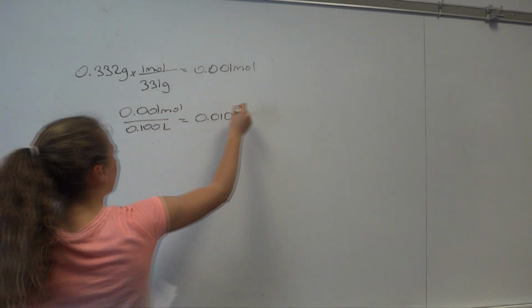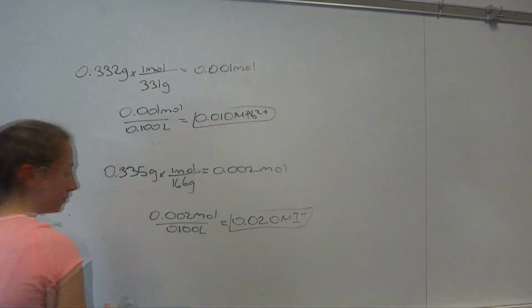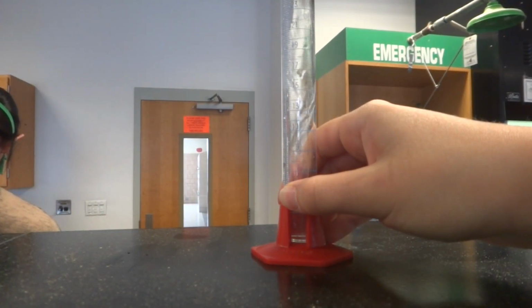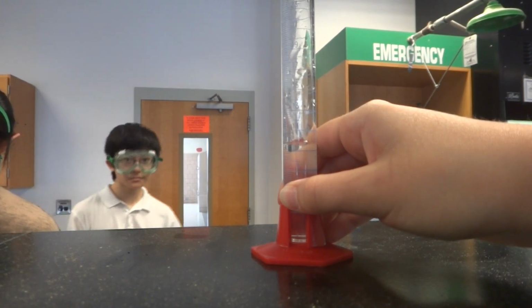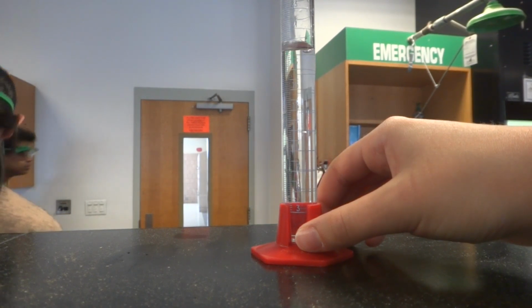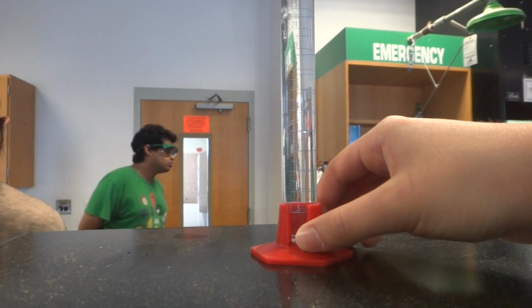Using dimensional analysis, we're using the masses we actually weighed out to determine the molarity of each solution. To find when the solution is at equilibrium, we're using varying concentrations of each stock solution with varying amounts of water. We are ultimately looking for the beaker in which the smallest possible amount of precipitate is found.